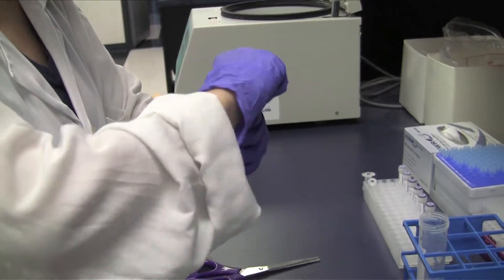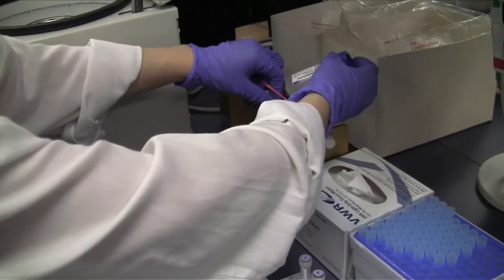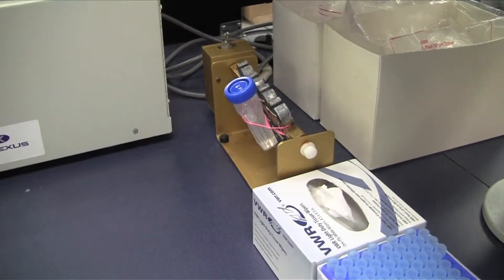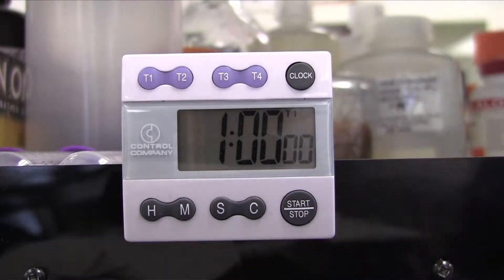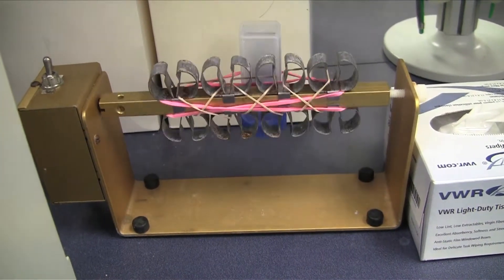Place the microarray into the microarray slide container and keep the container on the rotator in slow motion at room temperature for one hour. Make sure the microarray is constantly submerged in the blocking buffer.